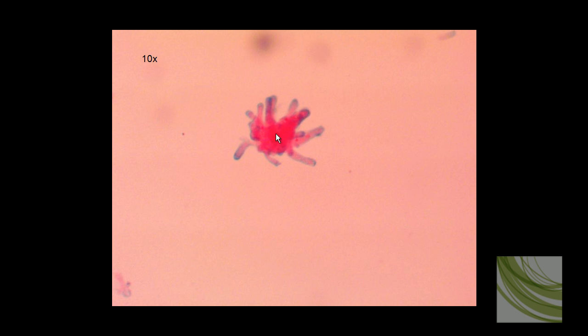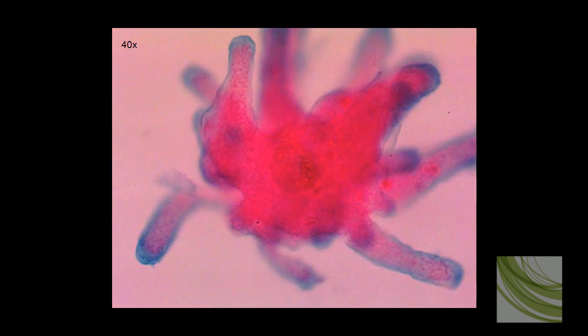Here we can see the amoeba using the 40x objective. We can see the two different stains, a green and a red. There's obviously the nucleus. Not sure if that's the tip of a pseudopod or maybe a food vacuole. Possible food vacuoles there and there.